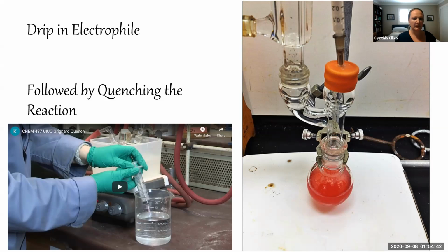electrophile. So sometimes, depending on the electrophile that's added, the reaction can be very colorful. For example, when phenylmagnesium bromide is prepared as the Grignard reagent, if you add in benzophenone en route to triphenylmethanol, we get a nice pink color for the solution after the benzophenone solution, which is a ketone solution, has been added. After that has stirred for a little while at room temperature, the reaction is ready to be quenched.